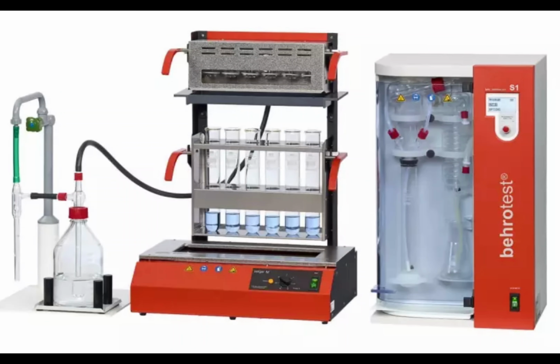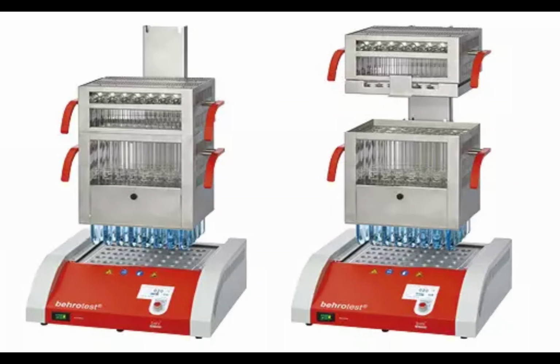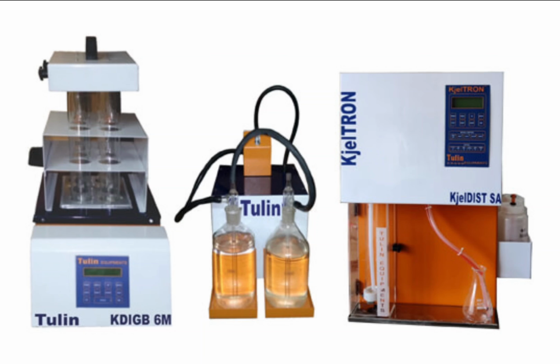Although it is a gold standard method, it has some limitations. It measures total nitrogen, not protein directly. Some non-protein nitrogen compounds may affect the result. Strong chemicals like sulfuric acid and sodium hydroxide require careful handling, and digestion takes time compared with some rapid protein analyzers.